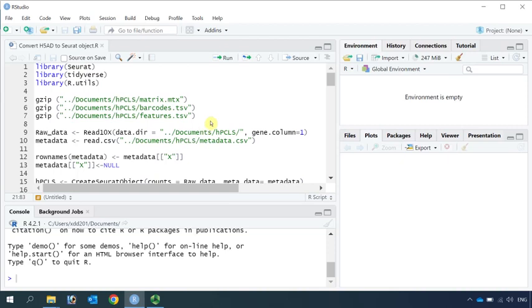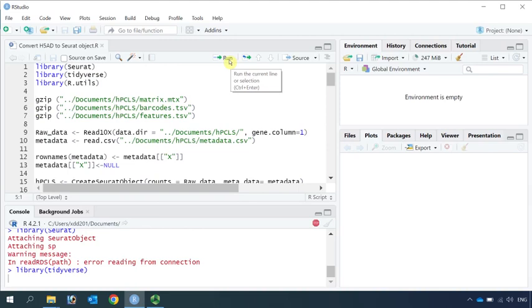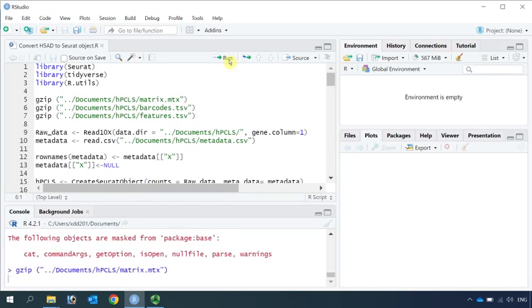Because Seurat requires gzip files, first we need to convert the matrix, barcode, and feature files into gzip files. So let's load our libraries. The R utility package is the one for gzip. So now we can zip our files.